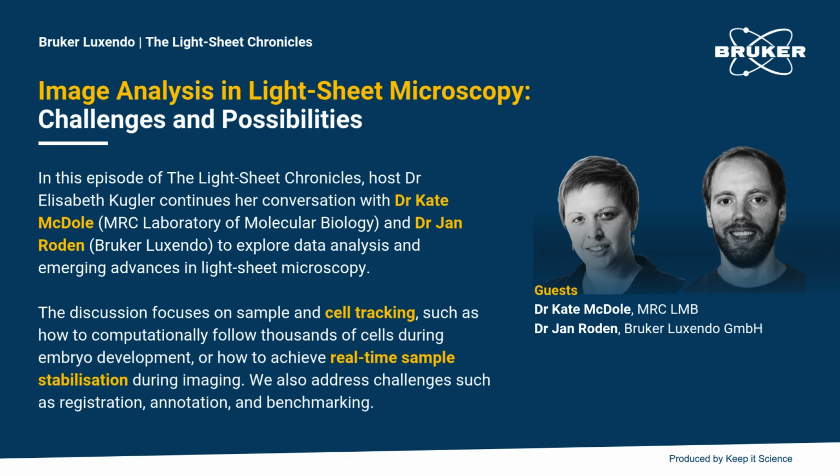So you often need some kind of elastic registration that goes beyond a global transform, but that can align local elastic distortions well enough. And so I think it's a very challenging part.